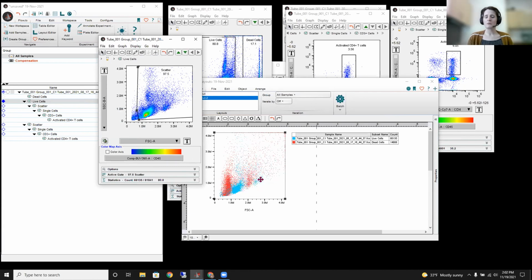So if you are working with rare populations, or trying to figure out a really reliable data set to understand where your cells are as far as population expression and intensity, you can't really rely on data where you're just using a scatter gate for viability. It's something that we hear fairly often in SRLs, and it's something that we try and combat quite a bit, because it is so critical and because it will have such an impact on your research.